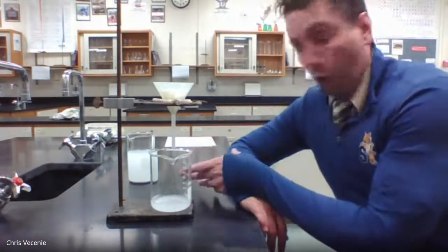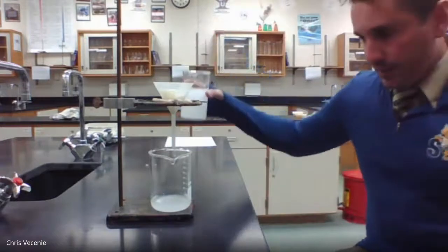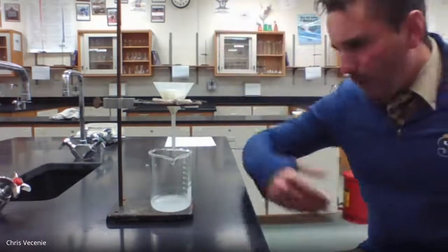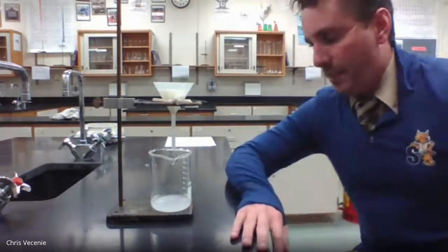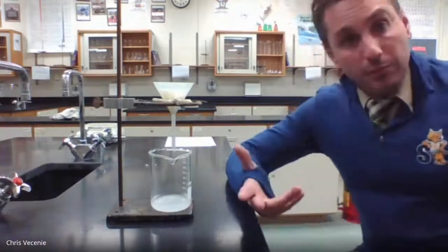from a beaker I had earlier, right? So this was what you guys saw from the precipitate. I've been filtering this for a little bit of time. I'm going to let that drip out, it's the last tiny bit of what you're seeing. All right, so even that is going to take maybe a minute or two.